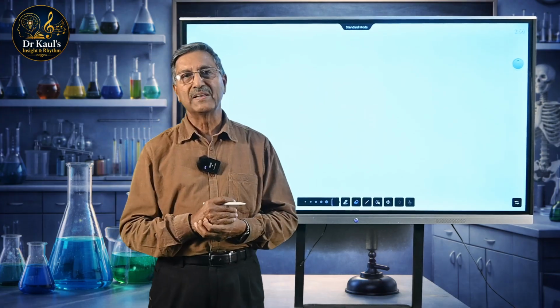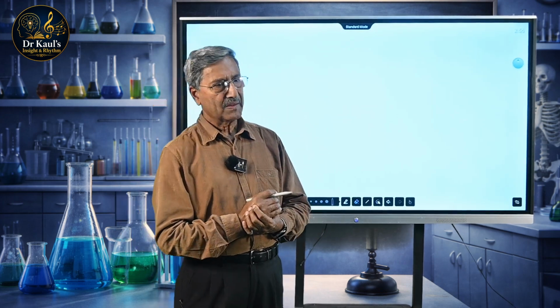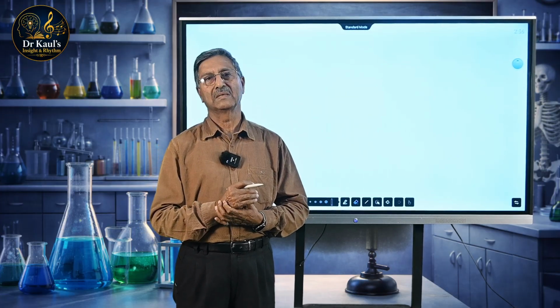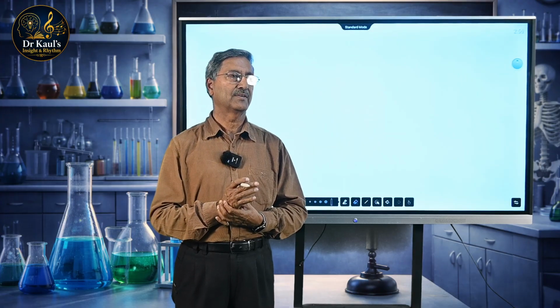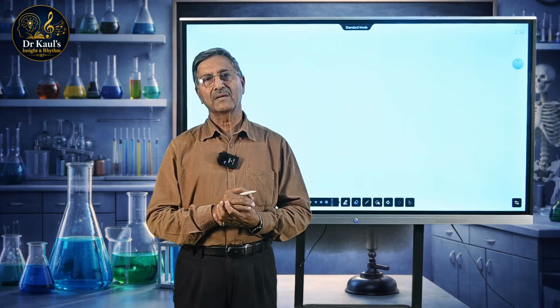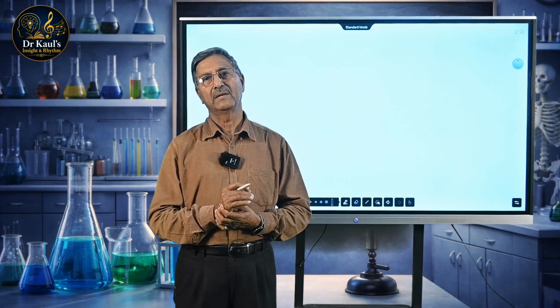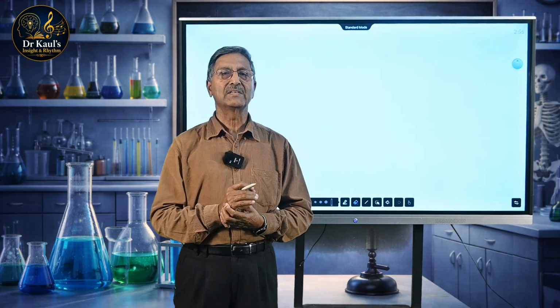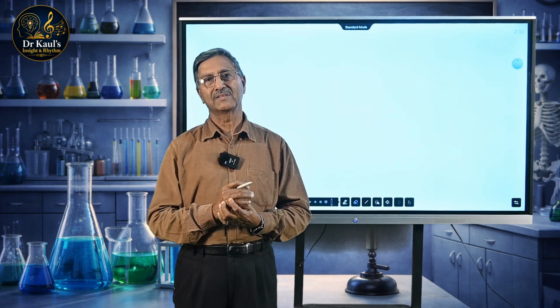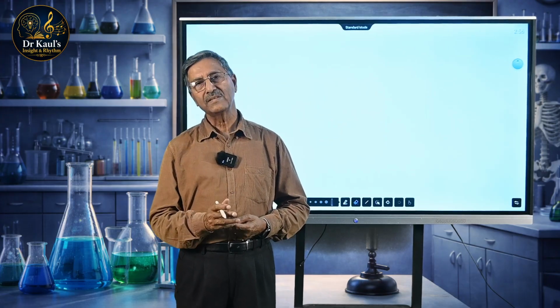Now today we will be discussing the confirmation of acid radicals. In the previous lecture, when we were doing the indicative tests, I shared with you that, being a very preliminary stage of information, we are not considering radicals like tartrate, chromate, arsenite, arsenate, etc. for discussion. So confirmation also will be limited to the confirmation of chloride, bromide, iodide, nitrate, acetate and oxalate.